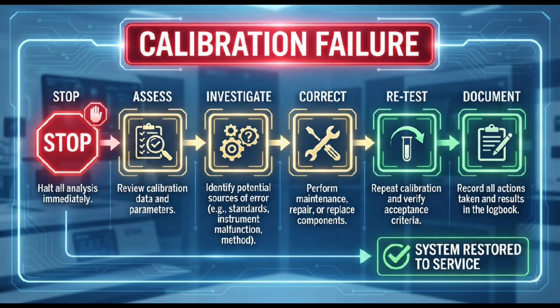What if calibration fails? What should you do if an HPLC calibration test parameter fails? Do not simply repeat the test until you obtain a passing result. First, stop and assess the situation. Review the raw data and procedure. Check whether the correct standard and equipment were used. Verify the calibration status of reference instruments. Check for leaks, bubbles, contamination, incorrect settings, or other obvious causes.